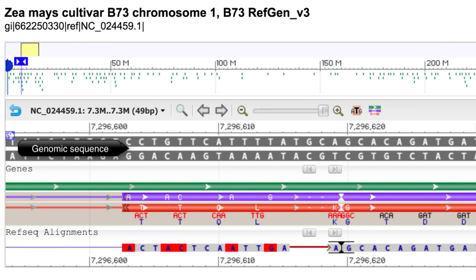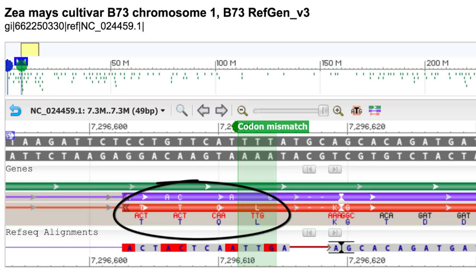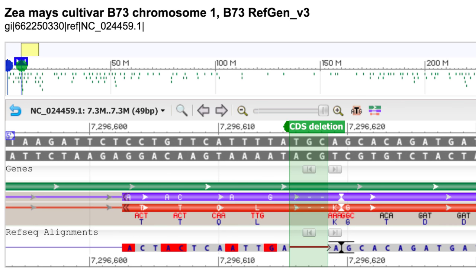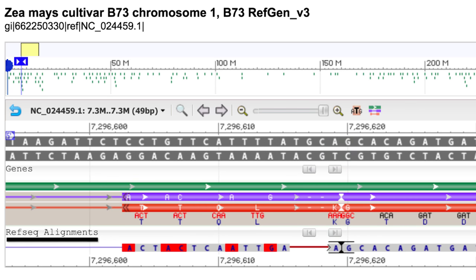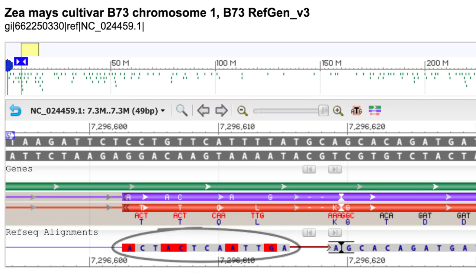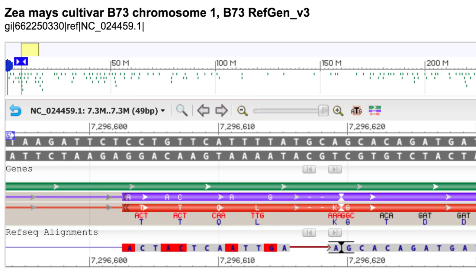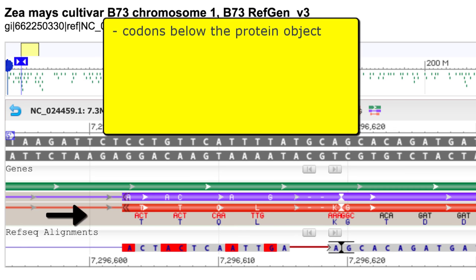In the first example, I'm zoomed in on a portion of chromosome 1 from ZMA's cultivar B73, and we've added markers for a codon mismatch—there are four codons here with mismatches—a coding sequence or CDS deletion, and a CDS insertion, all in an exon of a gene. This view also shows the RefSeq alignments track with mismatches in red. The new renderings in this case are codons below the protein object.